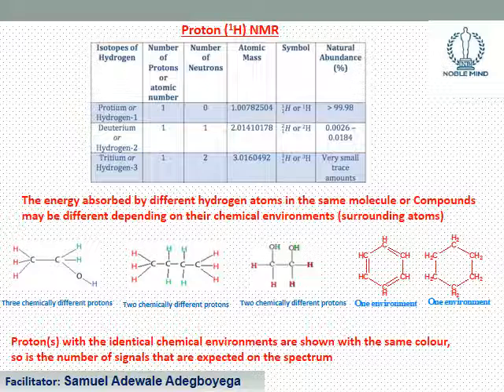From that we could see that the hydrogens on the first carbon and the last carbon atom represent a single environment. Let's look at the 2 carbons in the middle. Each of them carries 2 hydrogen atoms, and let's pick carbon 2.